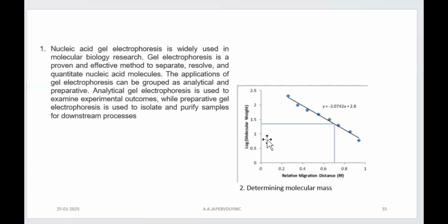Now you can assume the protein complexes to have a long rod shape, which is the denatured protein now, and the entire mobility of the protein is not because of the charge, but because of the molecular size of the polypeptide, right?